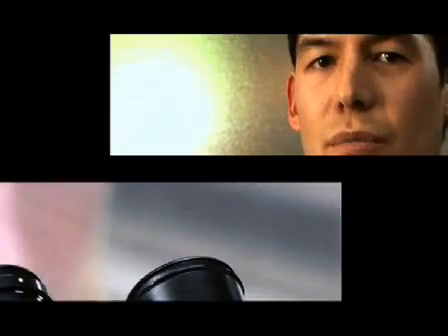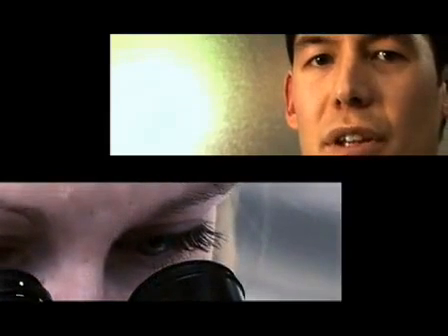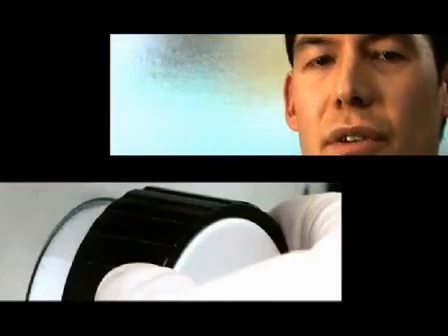I'm a member of the Laboratory for Tumor Immunology and Transplantation Immunology at the University Hospital of Cologne. In this video, we're going to show you how you can generate human CD40-activated B cells from peripheral blood mononuclear cells. One of the main interests of our laboratory is the study of the antibody-independent functions of B cells.